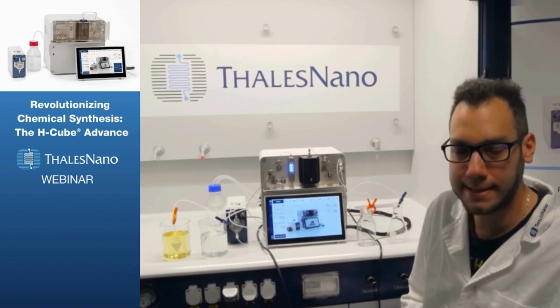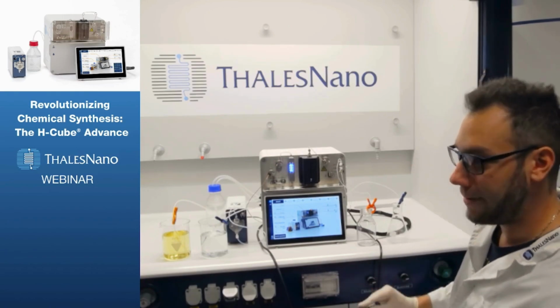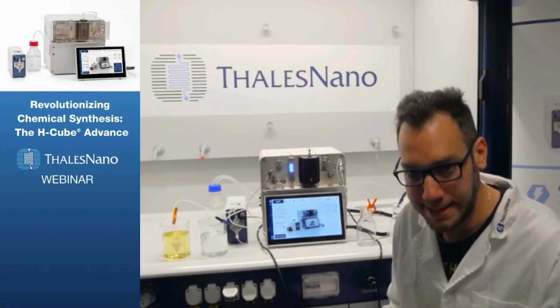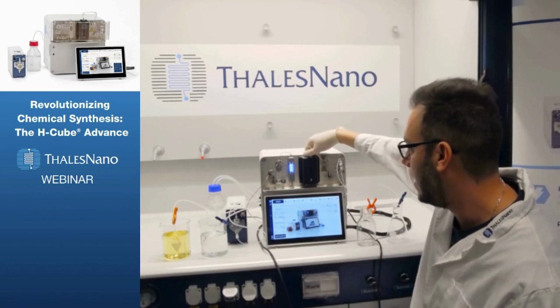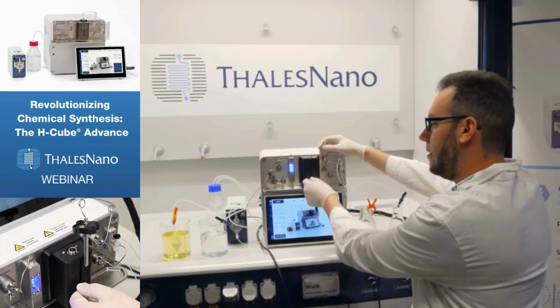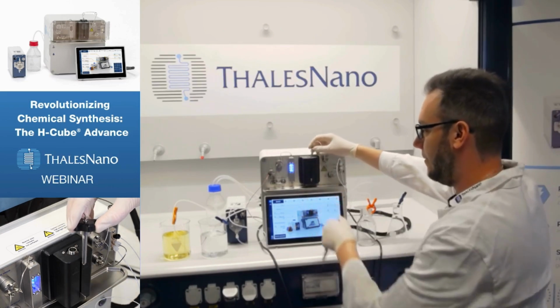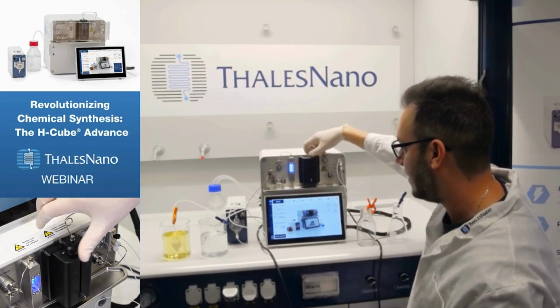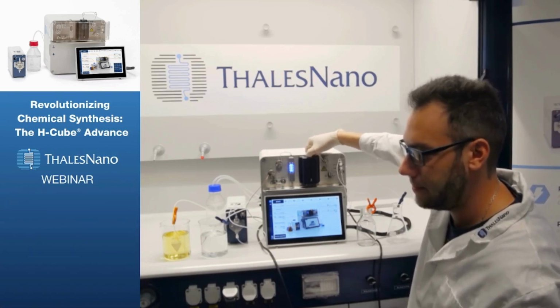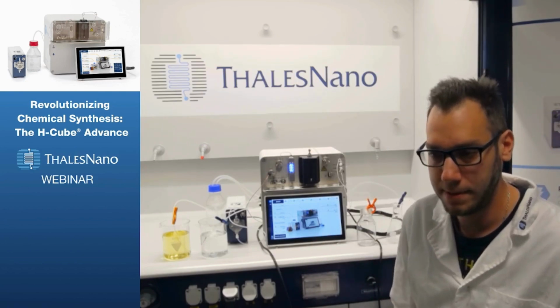If you would like to change this catalyst cartridge, for example, to do a catalyst screening experiment, all you have to do is just to unmount this little hand-tight fitting on top. You don't need any tools for this. It's perfectly possible to do by hand. And if you do that, you can use the lever to lift the cat cart and then change it to a different one. And once you do that, all you have to do is to screw back the top, and you are already ready for the next experiment or the next catalyst type.